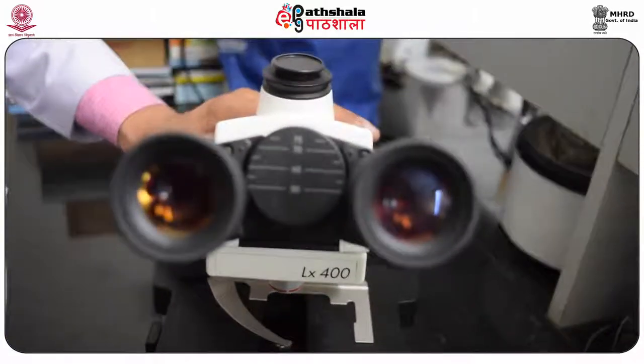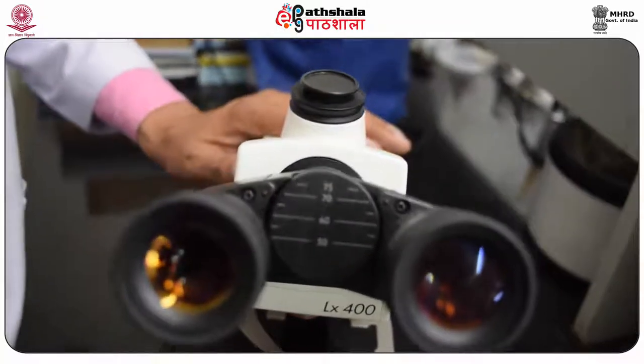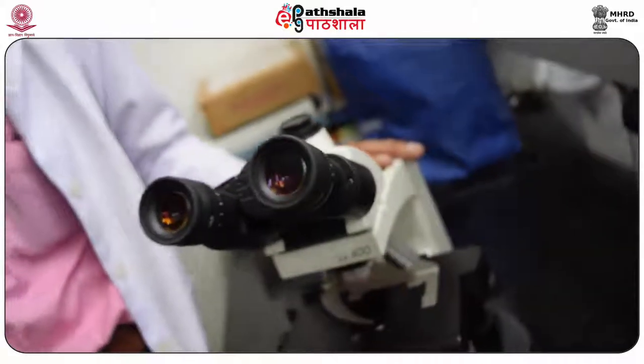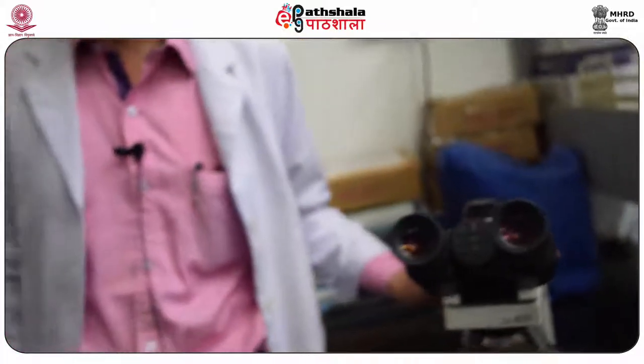Even the type of growth, the pattern of growth, and the extent of growth, meaning how much area is covered by your cells during their growth, is watched with the help of the inverted microscope. During splitting, we also need to check cell detachment with the inverted microscope. Therefore, the inverted microscope is one of the basic instruments without which no culture is possible.